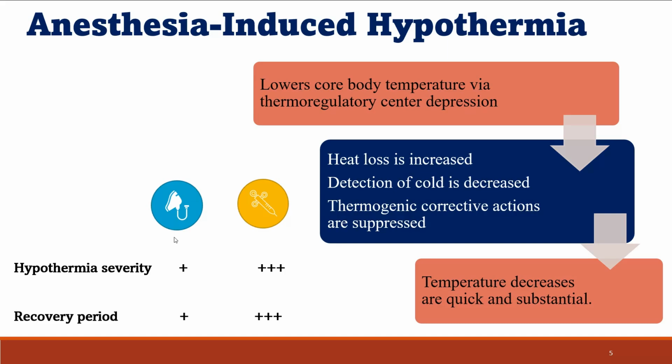These are key differentiating points that should be considered by a lab which is developing a new anesthetic protocol or revising an existing one: it is always beneficial to opt for an inhalant anesthetic rather than an injectable one.